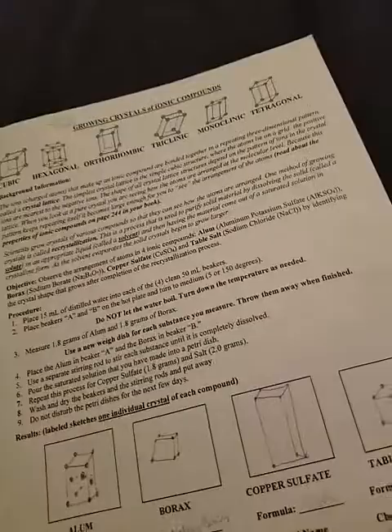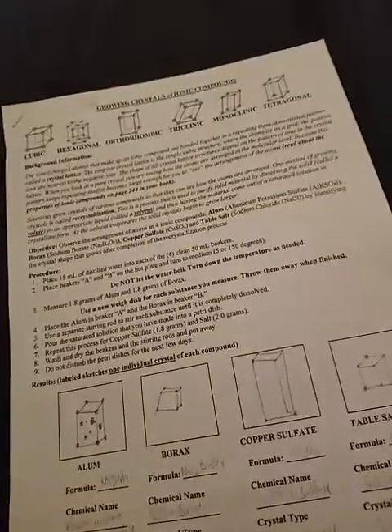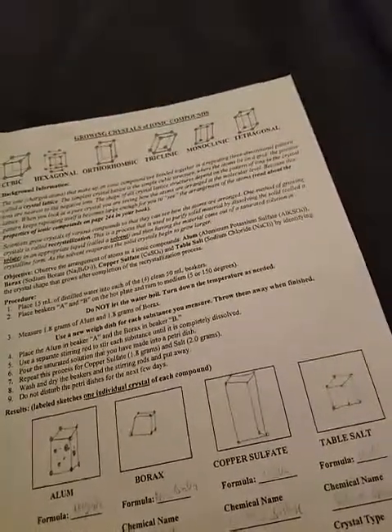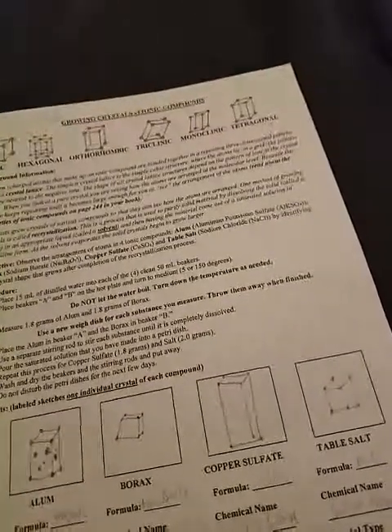As far as errors go, our group did end up boiling the water a little bit, like it says not to in the procedure. And then as well, our group also left the covers of the petri dish on over the weekend, so it may have not evaporated the way it was supposed to because it was sitting for way too long. But yeah, the crystals still formed, but they may not have been like they were supposed to.